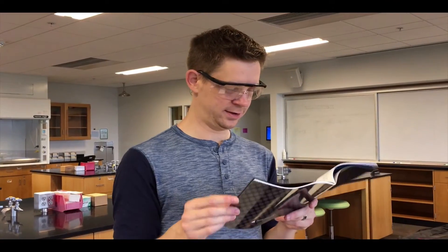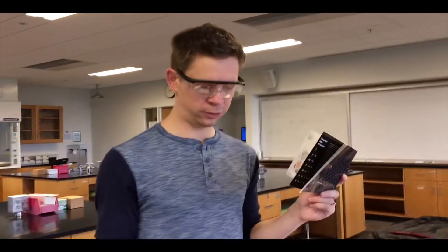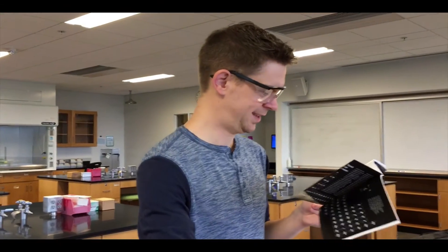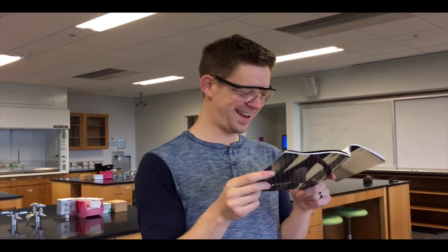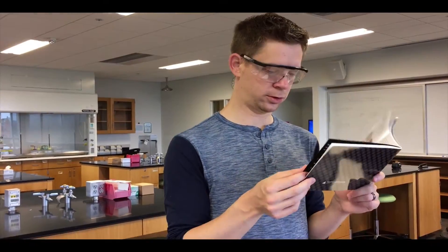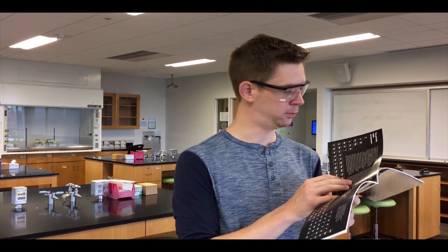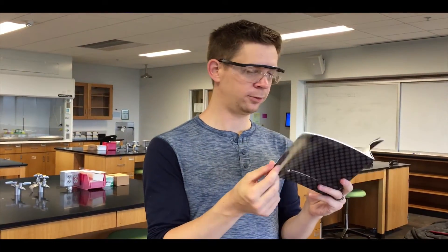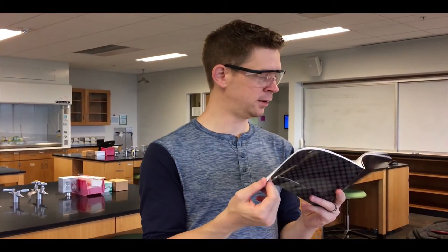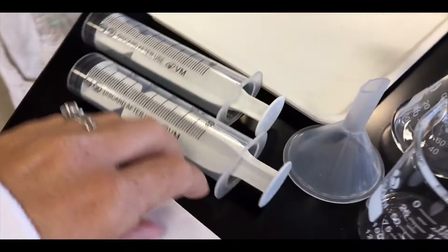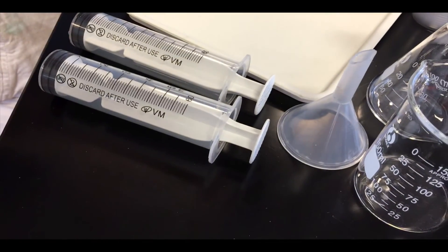Solid fuel stove, sounds like it would be like a character on Game of Thrones, flame divider. Yeah. Smartphone stand, corks, macro lens clip for smartphone, that's to turn your phone into a microscope. Periodic table, Mel chemistry app, assembling VR goggles, instructions, using VR goggles, third-party apps, conducting the experiments.